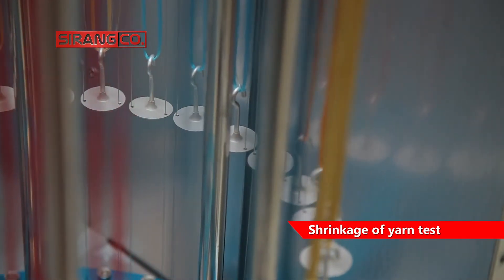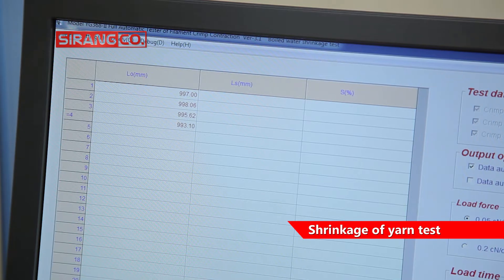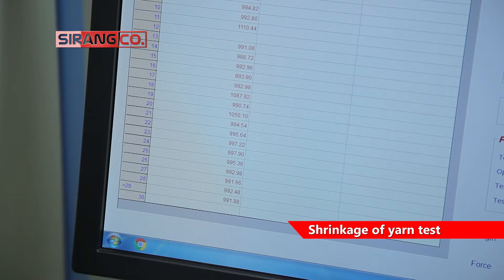In general, yarn shrinkage can be manually and automatically determined in skein or single-end yarn.